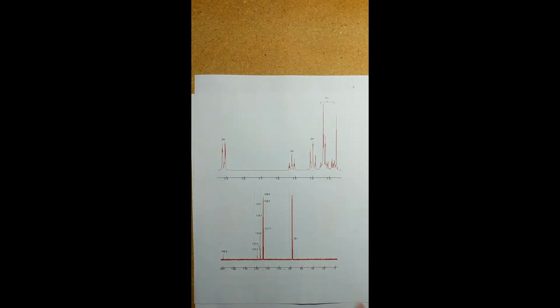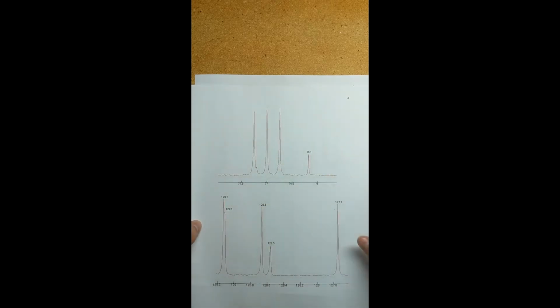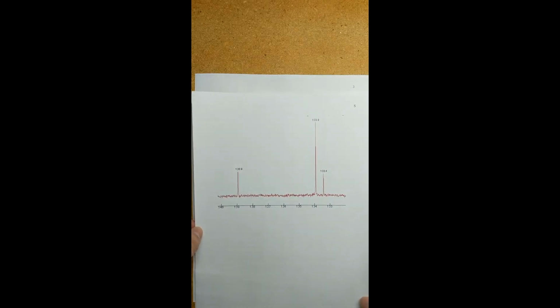Start moving from right to left, our first expansion here. You can see on the top of this image, in the middle, here's our expansion for that. And finally, our leftmost expansion here is the image for that. So as I work through on the main image, if you need to reference these through my speaking, you can go back and do so.